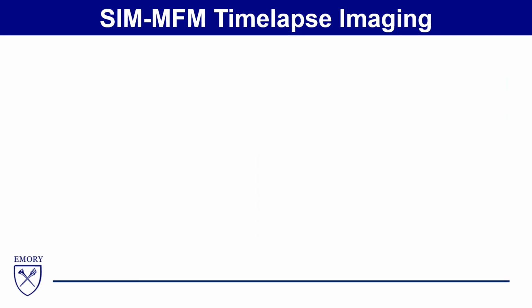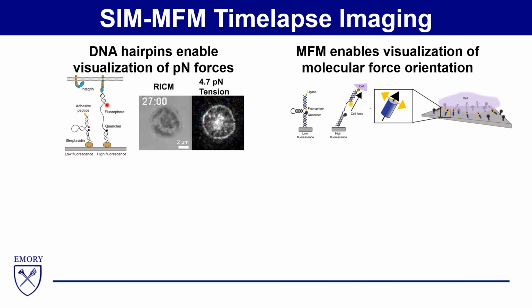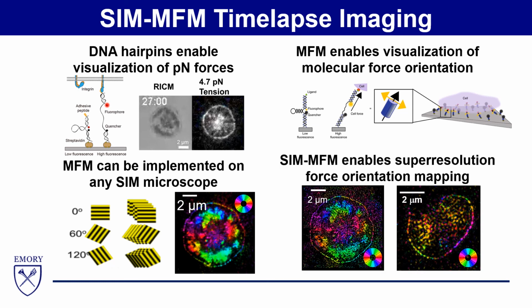So to summarize my talk, DNA hairpins are the most sensitive force sensors that have ever been reported. Molecular force microscopy enables visualization of molecular force orientation. Molecular force microscopy can be implemented on any SIM microscope, and SIM-MFM enables super resolution mapping of force orientation.